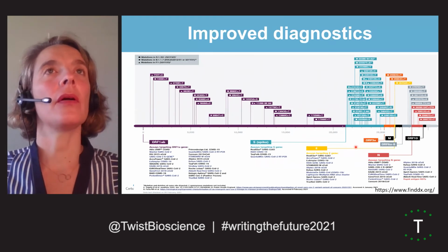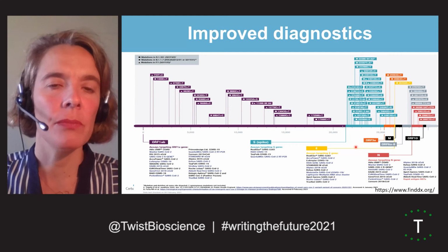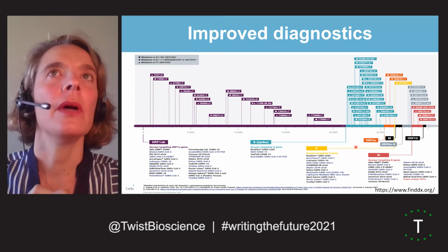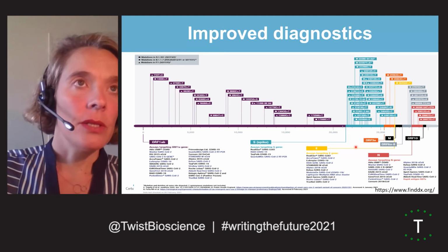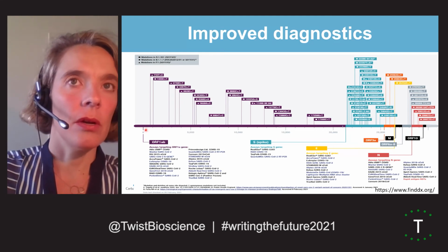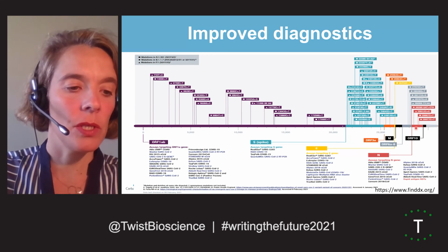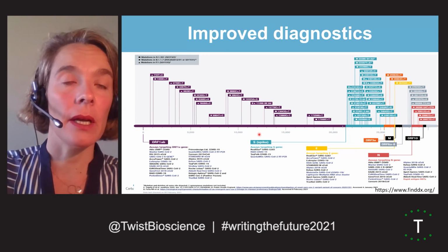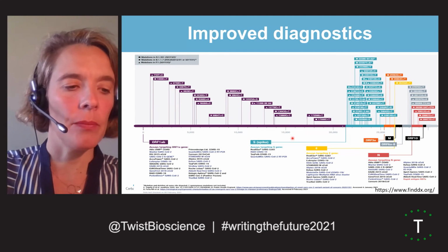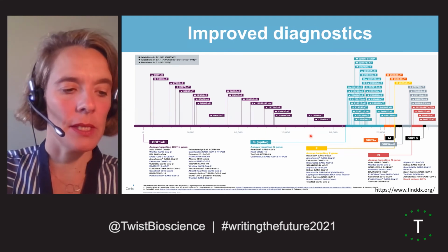The other indication for us, but perhaps not for the Public Health Authority, is to improve diagnostics. As you can see, there are a lot of mutations all along the SARS-CoV-2 genome, and if they are present on primers and probes design, they affect PCR performances.